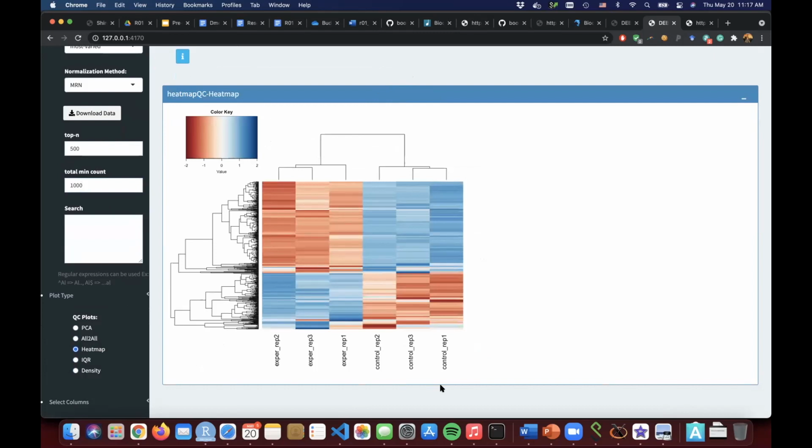But okay, this is an unbiased way of finding the genes if your data is beautiful like this, but there's still some variation here, you see in the heat map, that some of the genes here, as you can see here or there, have a huge variation. Maybe these are not real DE genes. Maybe the variation is huge, but there's still a difference that is not replicable in all the treatments. That means that maybe you shouldn't use them. That's why we use differential expression analysis to remove this variation bias.